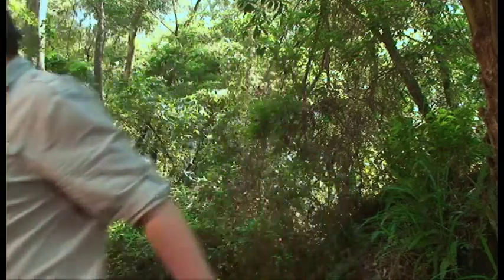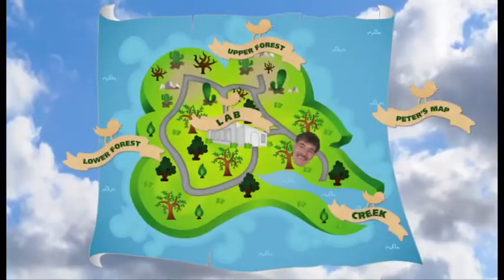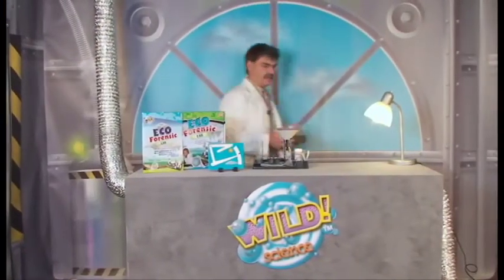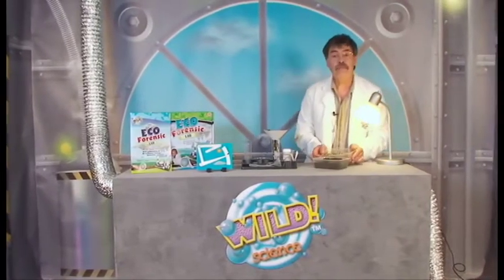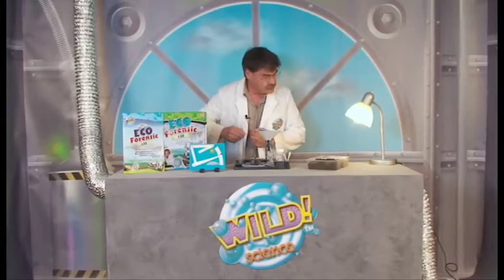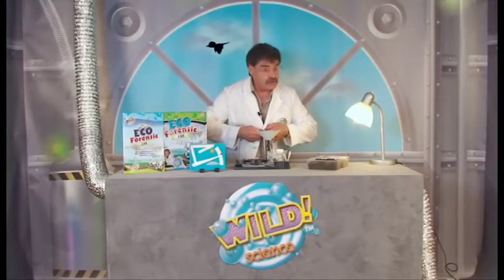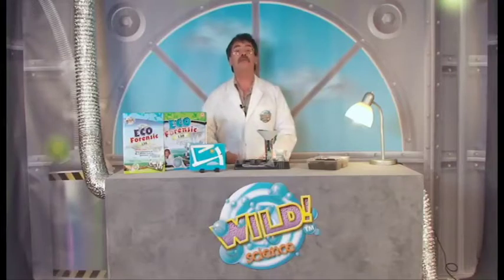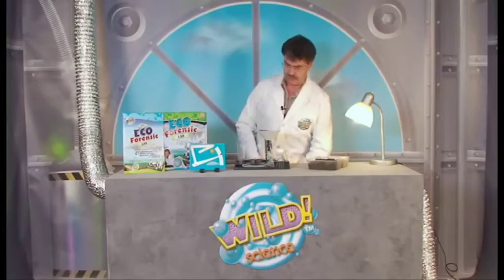Now we've done all the field tests that we need to do on the creek. But for the other testing we need to go back to the lab. Welcome to the Wild Science Laboratory. As you can see, I brought up the soil samples from the lowland and the upland forest, and I've already got my workbench set up ready to go.